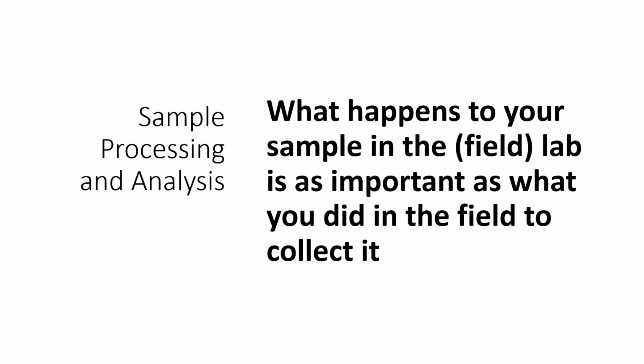Field laboratory processing and subsampling should also be conducted appropriately to reduce the heterogeneity within the collected samples and to improve the overall data quality. Verification procedures may be required to confirm that the data quality objectives are met.